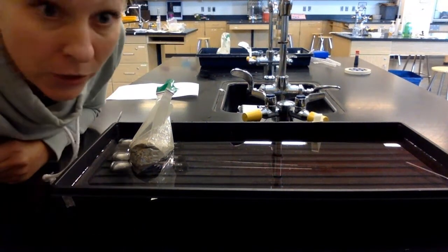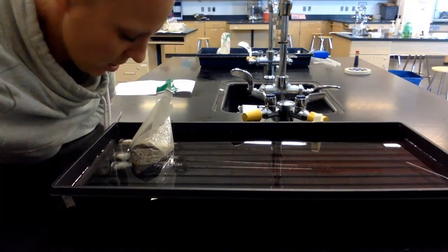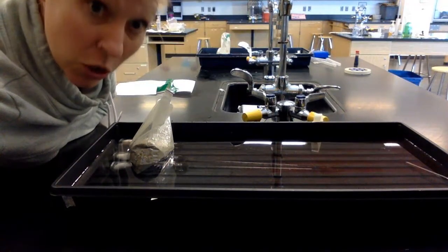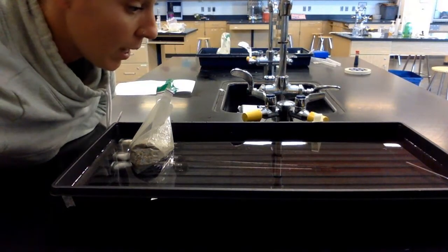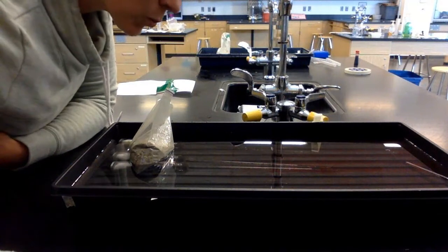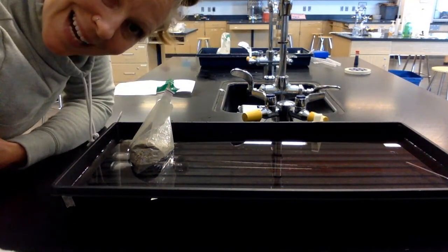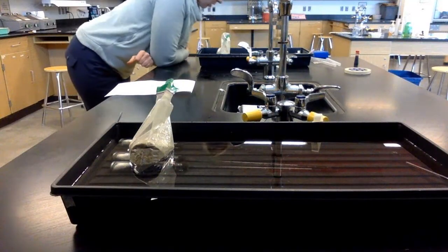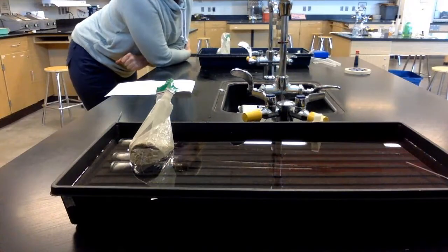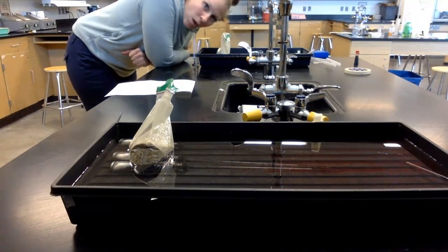Here we are at our last set of readings at minute 30 — a half hour has passed. For half an hour, these peas have been going through cell respiration to fuel their growth; they need to make ATP. Respirometer one: 0.51. Respirometer two: 0.83. Respirometer three: 0.90. Respirometer four: 0.74. Respirometer five: 0.82. Respirometer six: 0.91.